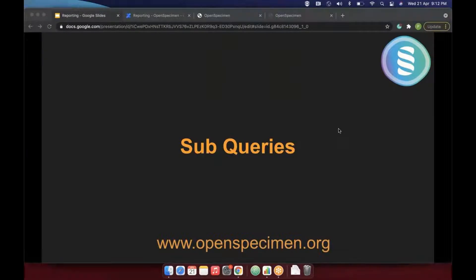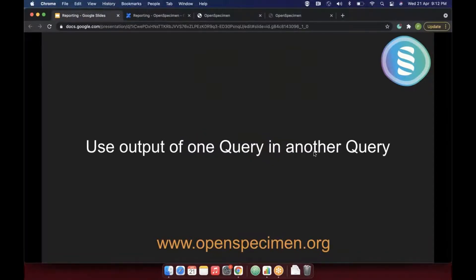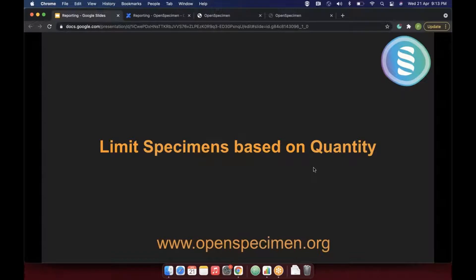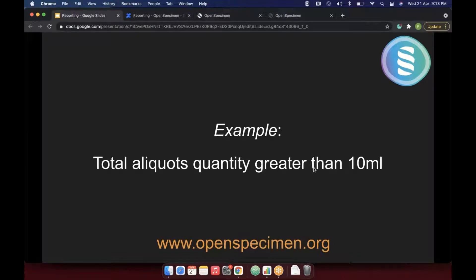To recap: we saw how sub-queries allow the output of one query to be used as input in another, enabling you to exclude certain patients or specimens from a query. We also saw how to limit aliquots or specimens based on a total quantity — for example, 10 ml or 4 ml per patient or per parent specimen — filtering results accordingly. This is especially useful for distribution.